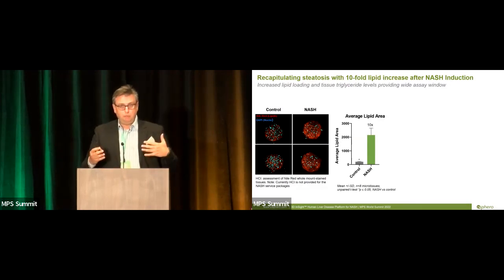If we just by pixel counting do a simple quantification of this image, we already see that we have a 10x increase from control to NASH condition. So it's a very strong signal. We have a great dynamic window in this model.